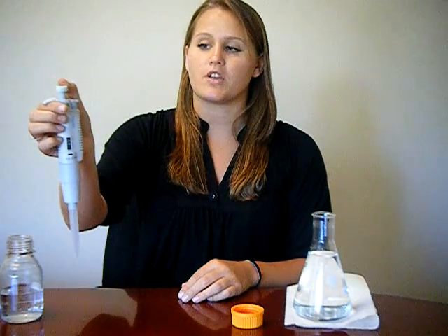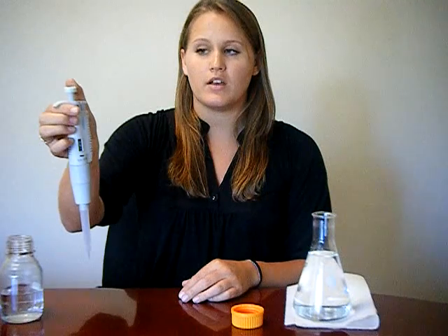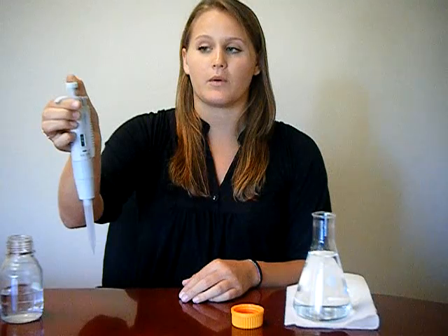The plunger on the top contains two different stops. The first stop comes easily and is used for when collecting a liquid. The second stop is just past the first stop and is used strictly when expelling a liquid.